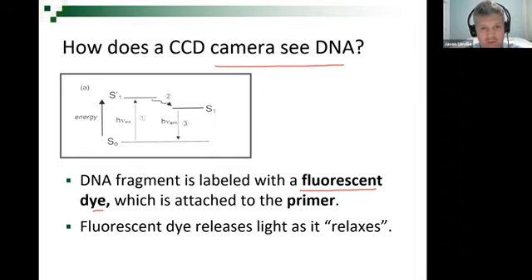When we filled out our sheet and amplified DNA, and did the primer calculation in the bottom chart, those primers were already labeled. If you buy primers in a kit that can amplify 16 loci at one time, the primers are already labeled.